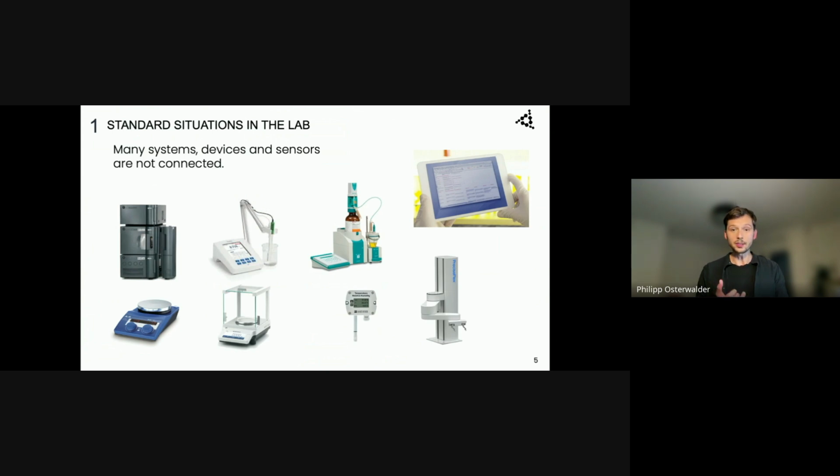If it's traceable, if it has all the metadata logged to it, and I know where it's coming from and the history of this data, and if it's in a proper format that I can use, for example, for advanced analytics or even AI in today's laboratory world to make faster and better decisions.